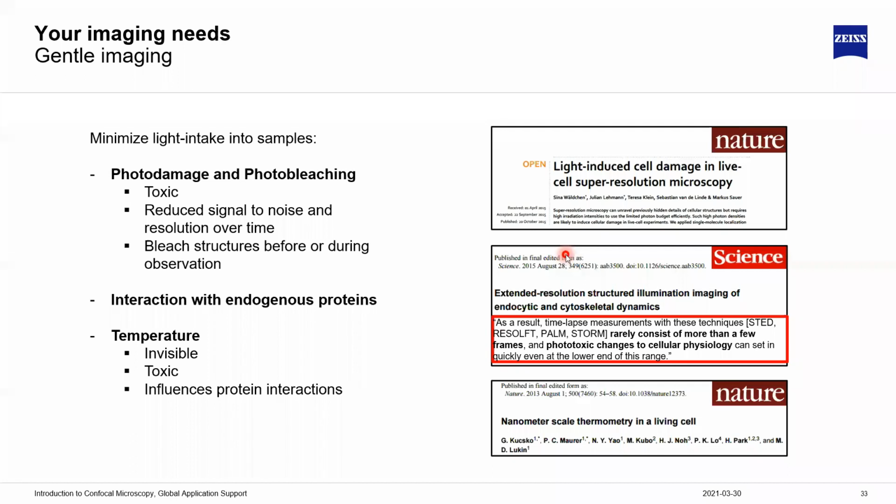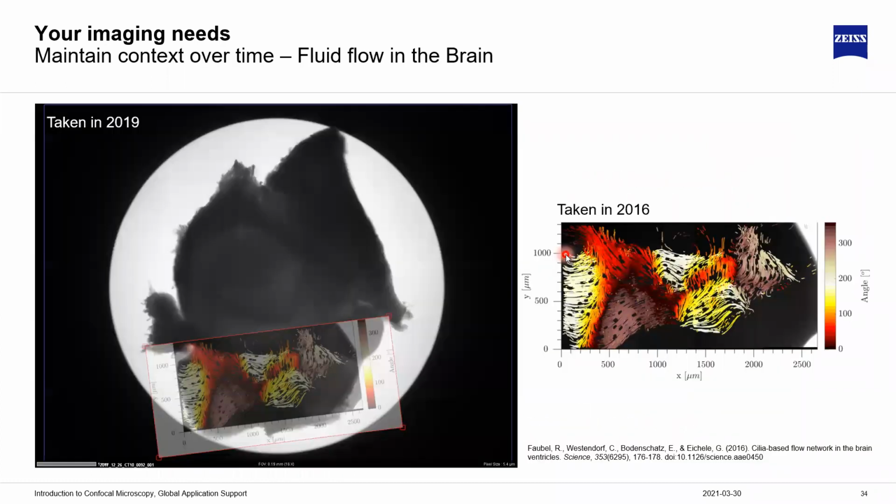So all these things are very important, in addition to having a high resolution, having good signal-to-noise ratio.